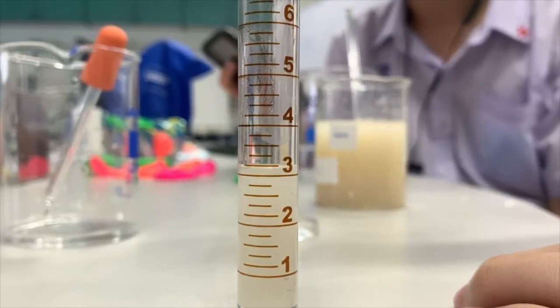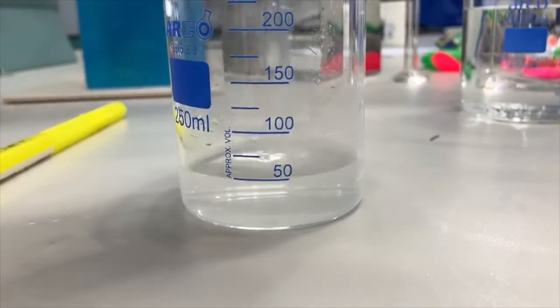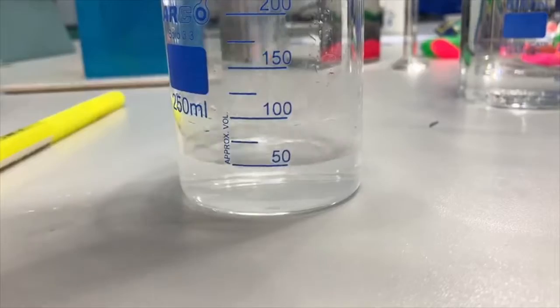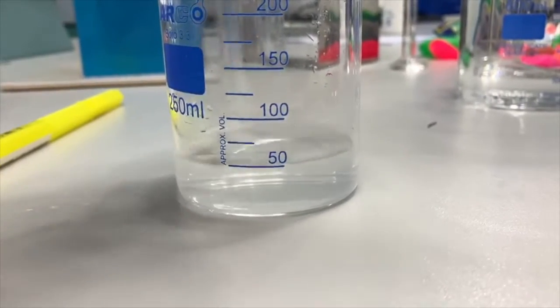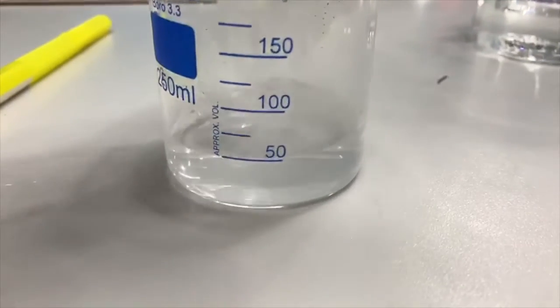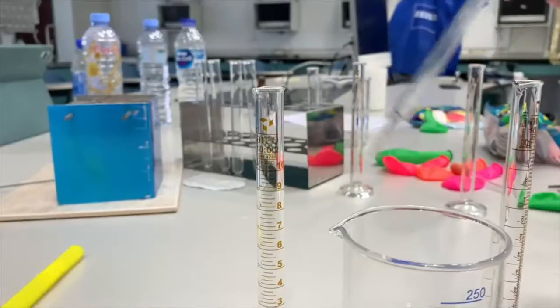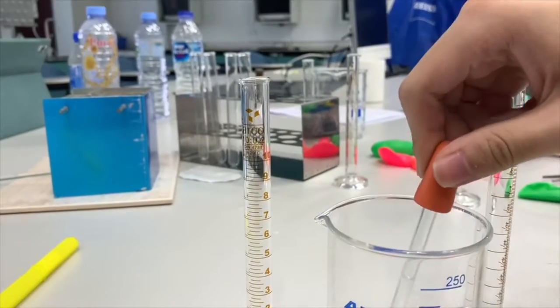The procedure is as follows. First, prepare warm water to 50 milliliters by using the alcohol burner. Second, mix 20 grams of yeast with 200 milliliters of water. Third, dissolve 100 grams of glucose with 50 milliliters of water.